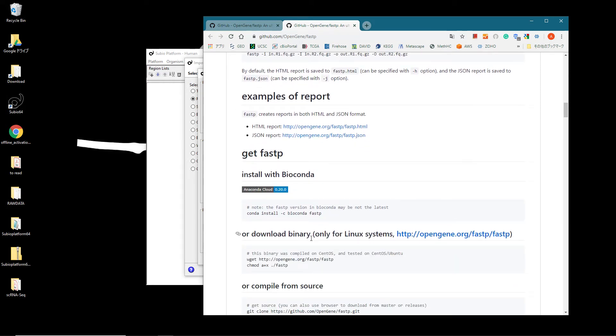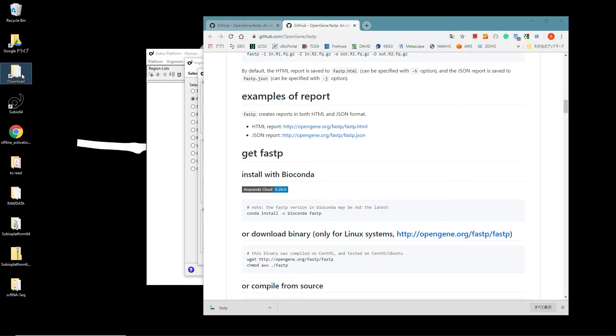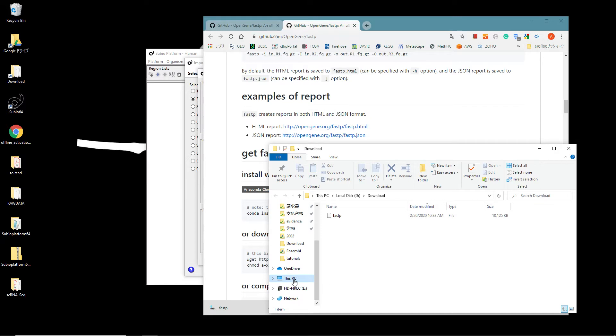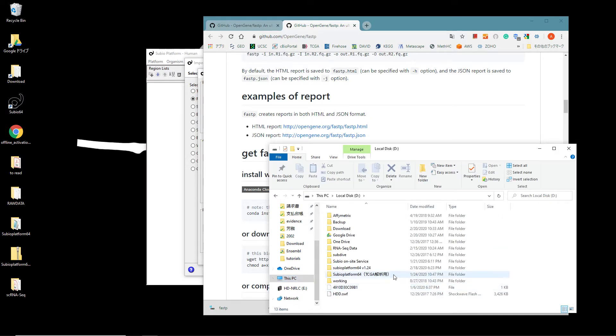Scroll down to the Get FASTP section. Click the link of the binary file for Linux systems to download it. You'd create a folder named RNA-Seq Tools.